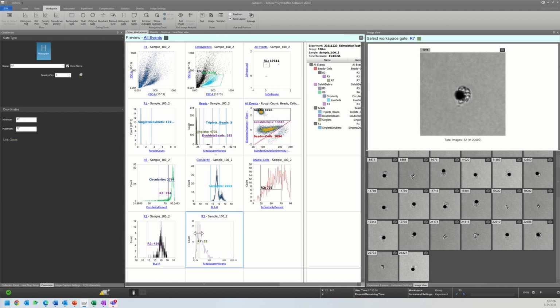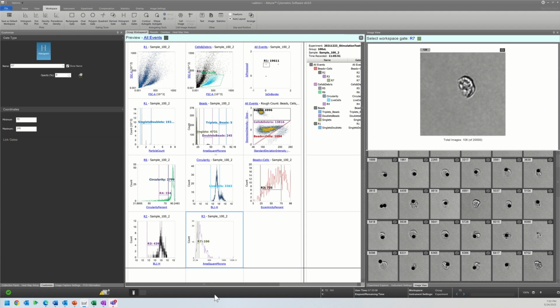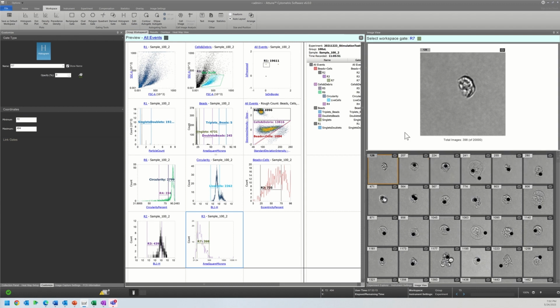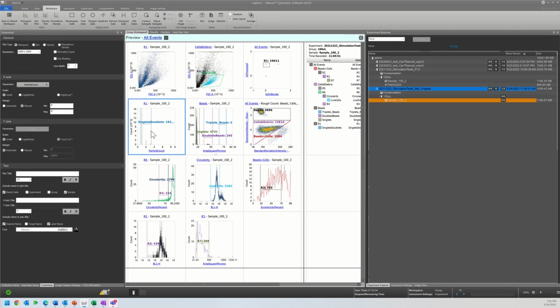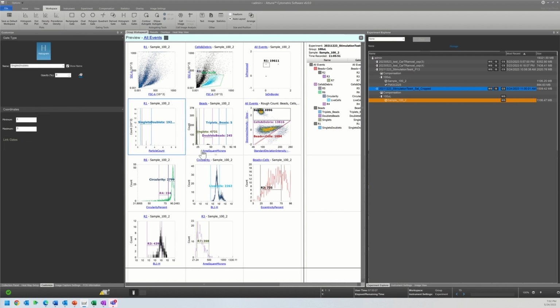and verify if there's something in the process that I'm doing that is shifting compared to somebody else. So these are just a few of the applications. And then don't forget that there's also the singlet gating that is very useful and is good for the rare events because it helps you eliminate anything that are doublets that are double positive because they're doublets as opposed to actually being cells.